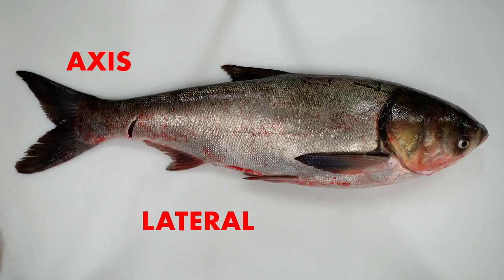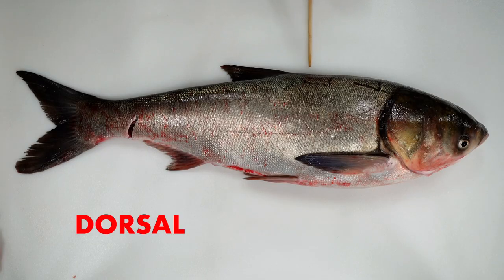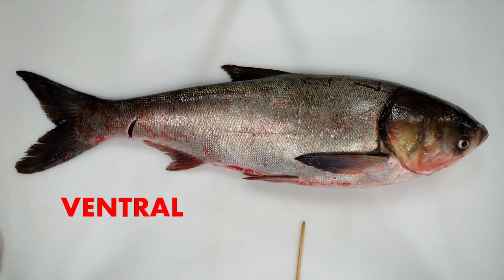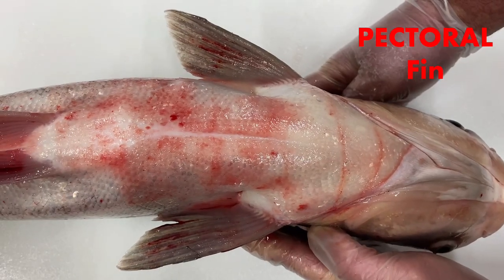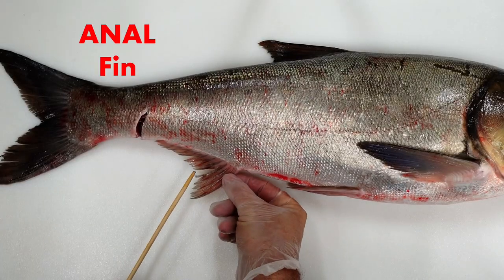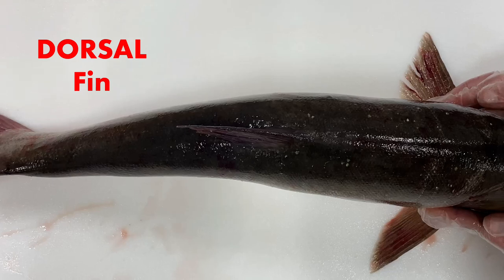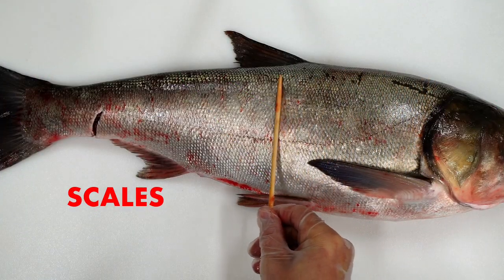Now let's label those axes. Hit the pause button if I'm moving too fast. On to our external anatomy and label the fins. Rays are the bony projections that support the fins in bony fish. Now let's label the remaining external fish anatomy that characterizes the silver carp.